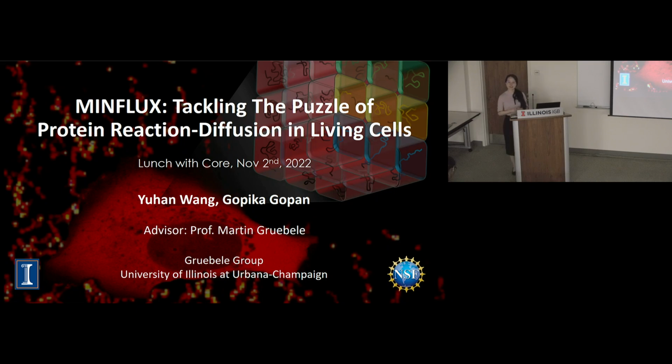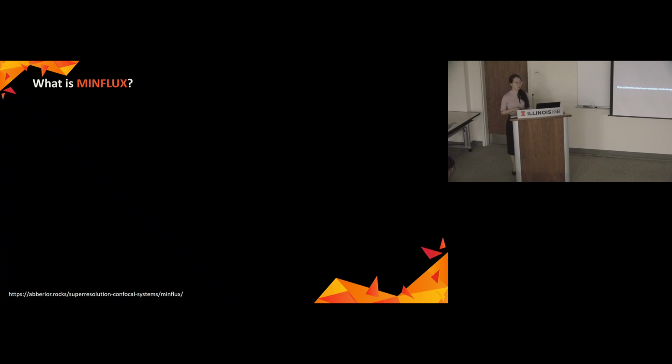Okay, as a new instrument, the first question you might want to answer is, so what is MINFLUX? Let me show you a video as an overview of what is MINFLUX.